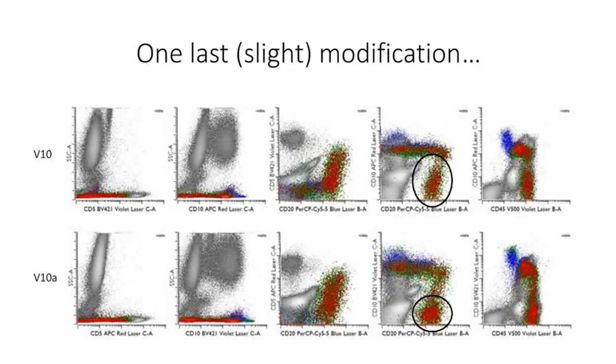Perfect. So this is the area I want to draw your attention to. This is normal bone marrow. Here are the B cells maturing. And these are the mature B cells.